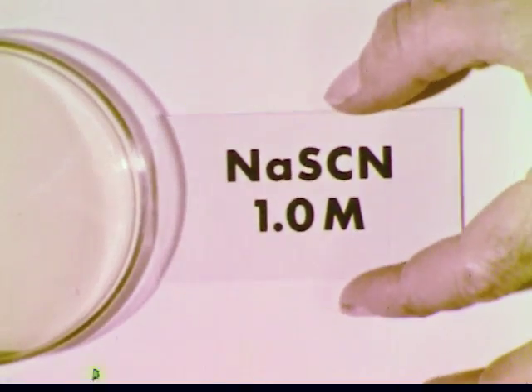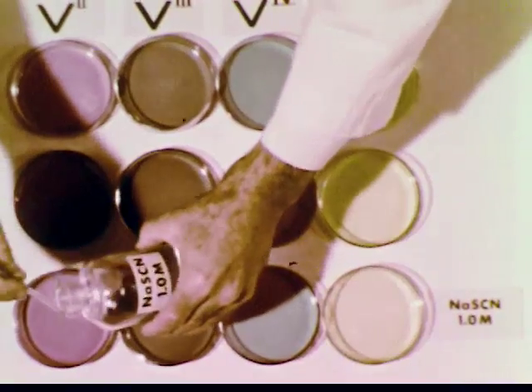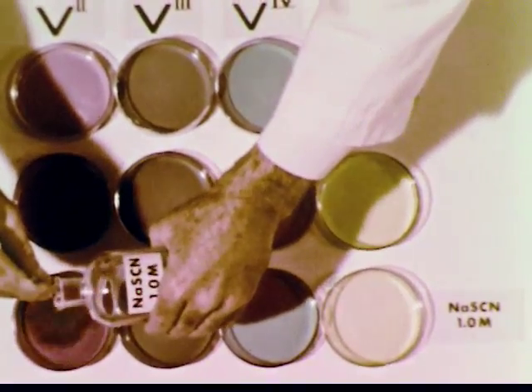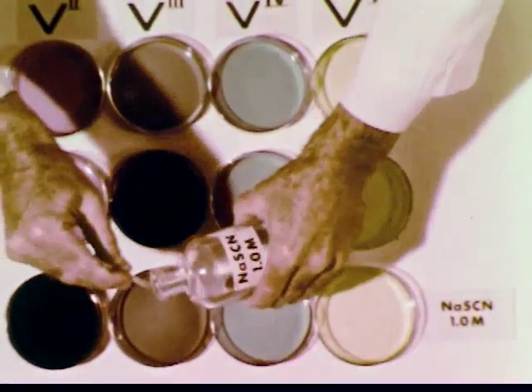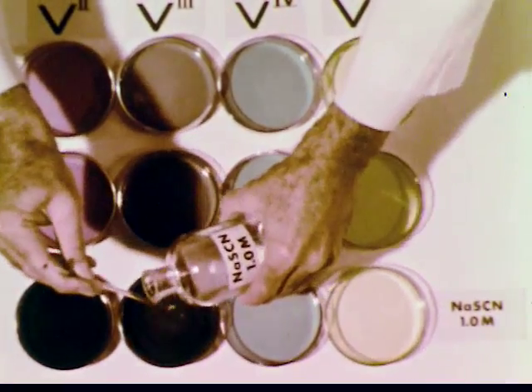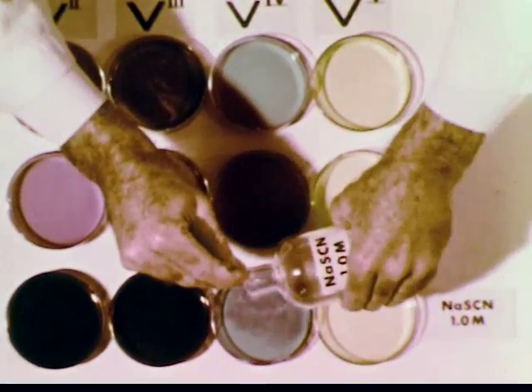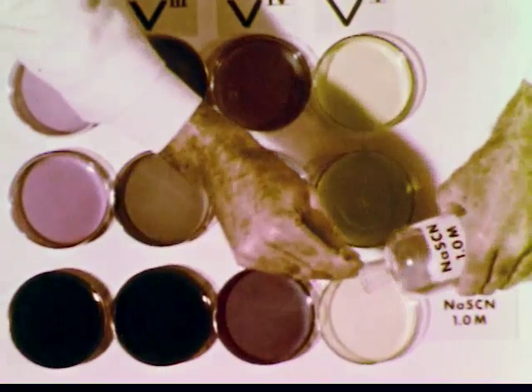First, we'll add sodium thiocyanate solution to the bottom row. These color changes are indicative of the formation of complex ions. They contain thiocyanate and are more stable than the water complexes with which we started.